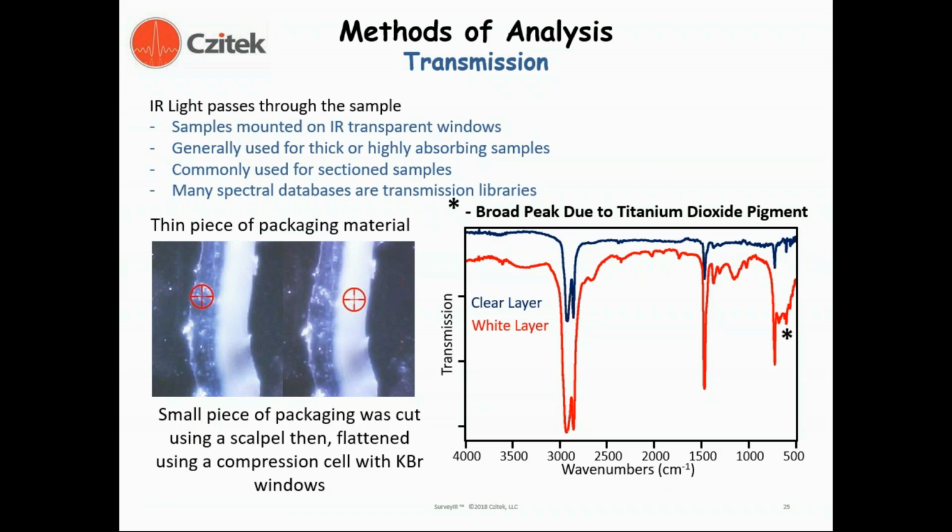Another aspect in transmission analysis is that many of the commercial spectral databases are actually transmission libraries. So that can be a factor in selecting a technique for analysis.